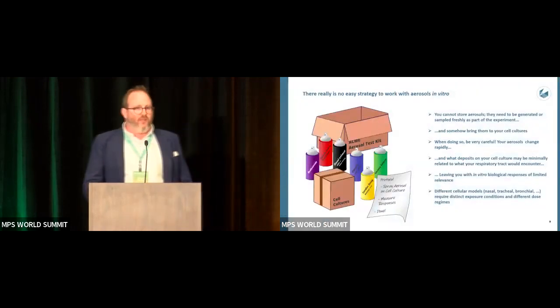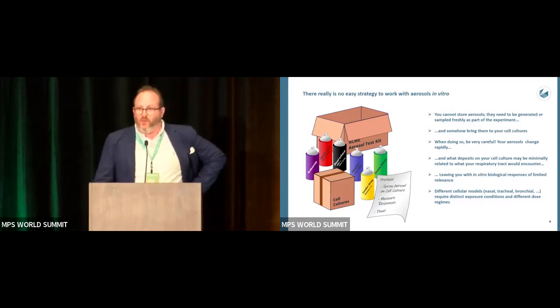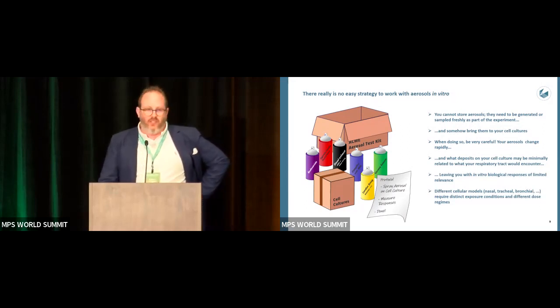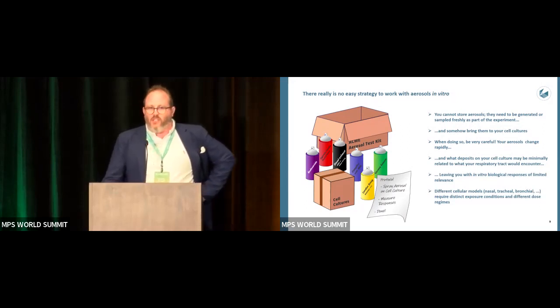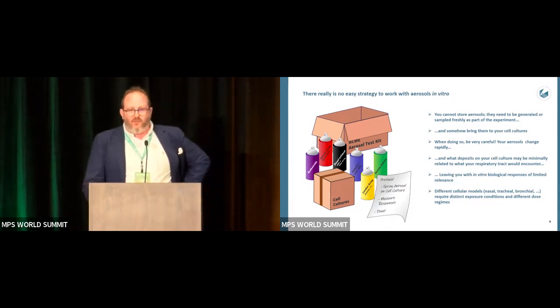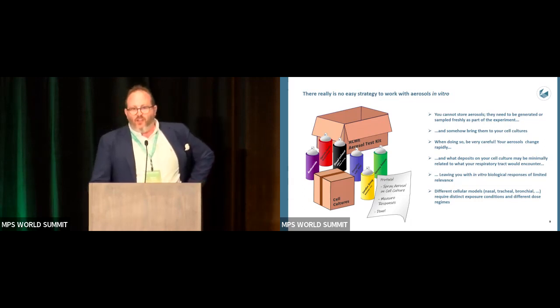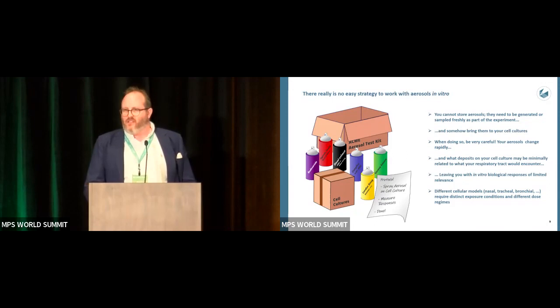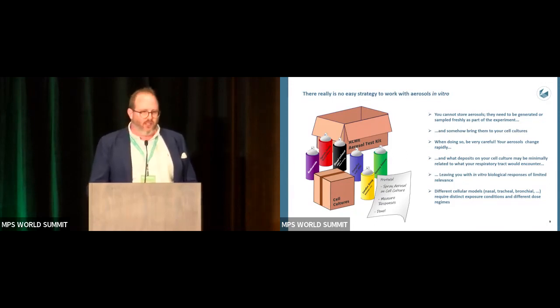So there's really no easy strategy to work with aerosols in vitro, because you cannot just store the aerosol and then put it on your cell cultures. They usually need to be freshly generated as part of the experiment, and you have to bring them to the cell culture. You have to be very careful because aerosols change rapidly, and if you do it incorrectly, you are left with a biological response of limited relevance, and you end up with an assumption and not really what happens in the lung.